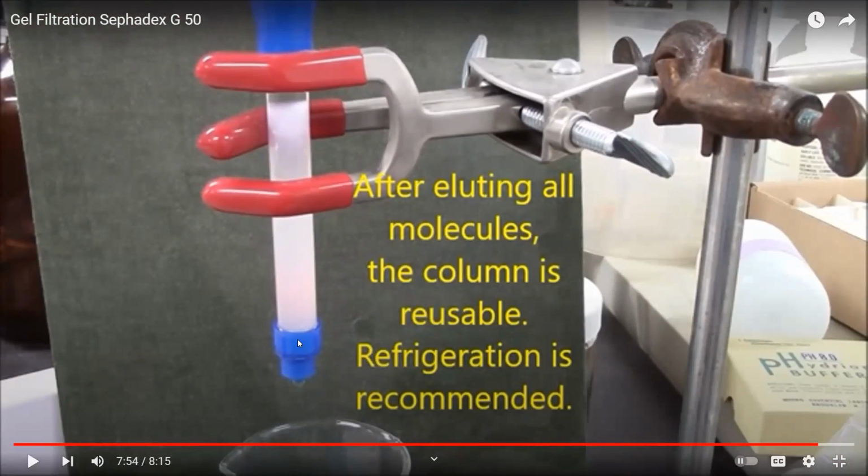So after you elute, when you are sure that there is no more biomolecule or any other analyte left on it, you keep some buffer over the gel bed so that it doesn't dry, and you can store this column in a refrigerator, or in a cold room. Usually laboratories have a cold room where the temperature is very low, so you can store that column there in the cold conditions and never let it dry, so you can reuse it later.